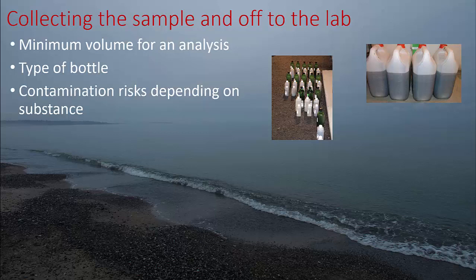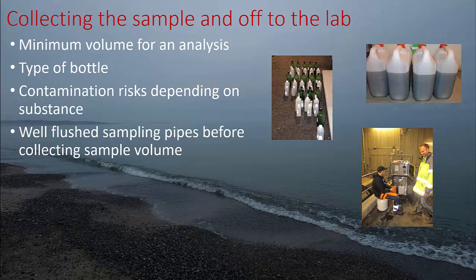Most samples or parameters are not difficult. Standard thing: well flushed sampling pipes before collecting the sample volume. This is a picture from a sampling we did where we took a sampler from another place and installed it at an intake point. In this case, we had very long tubes going down, and one of the things we were very careful with was flushing the tubes.